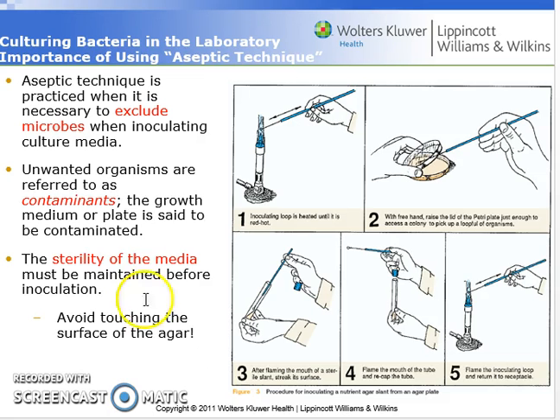The standard process when you do this is complete sterilization of the inoculation loop. Your inoculation loop consists of a loop on a wire. You have to heat this wire until it's red hot to sterilize it, and you do that by passing it over a Bunsen burner flame. Once you let it cool, you can collect a sample of your bacteria, and then spread it on your Petri dish plate.